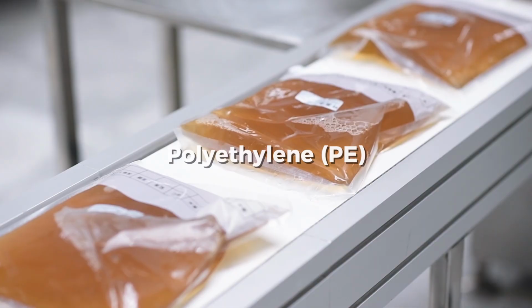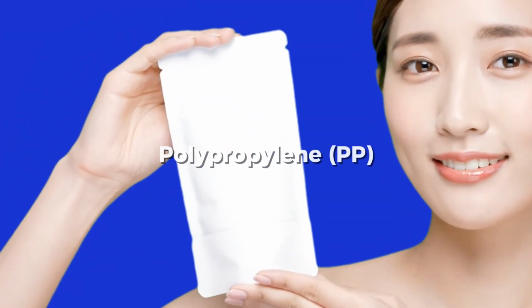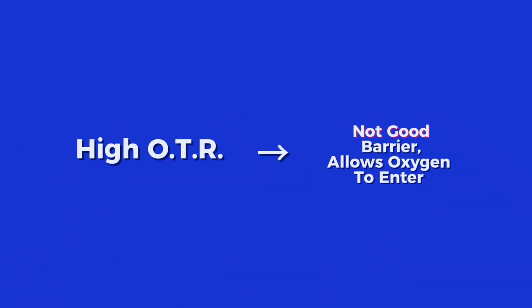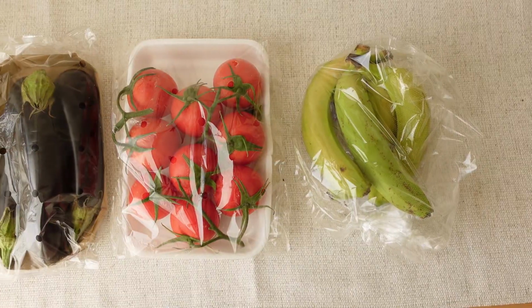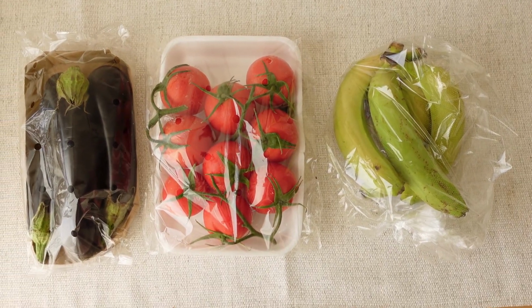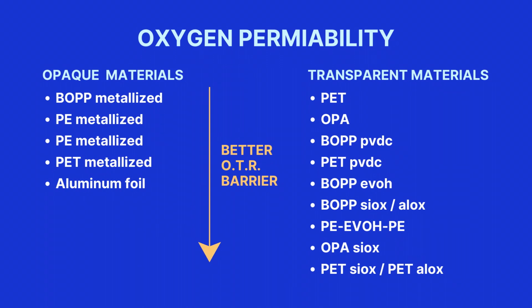In contrast, base polymers like polyethylene and polypropylene are highly permeable to oxygen. As a result, they exhibit high O.T.R values and allow oxygen to reach the inside of the package, a characteristic desirable for certain applications, such as fresh produce. The key is aligning the film's barrier performance with the product's shelf life requirements and sensitivity to oxygen.